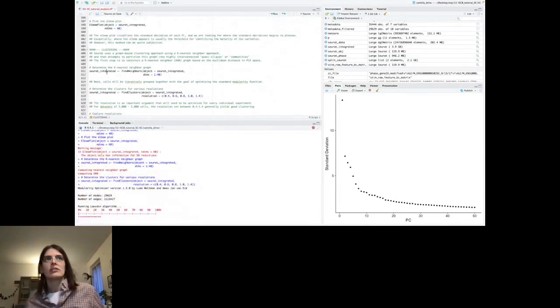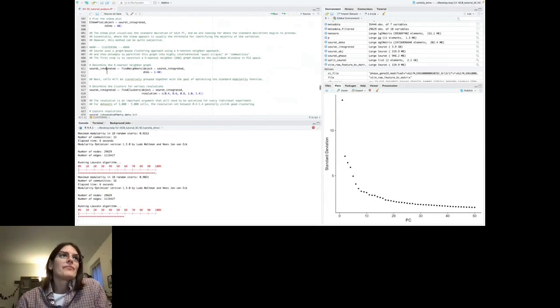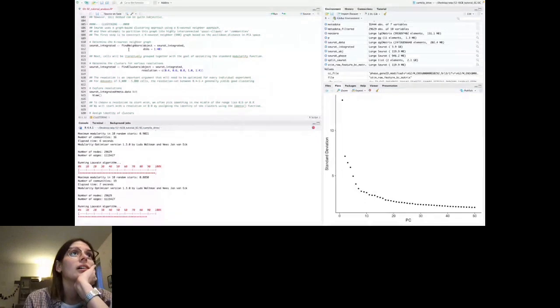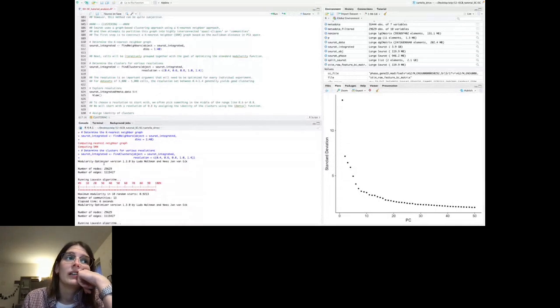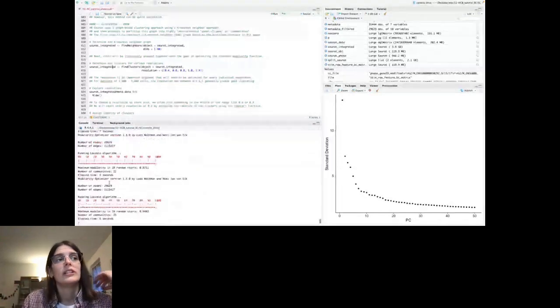It can find neighbors based on the graph that comes out when you plot everything using the information coming from the 40 principal components. Then once we find the neighbors, we perform FindClusters, so we perform the clustering, which is this, as you can see. In the Seurat manual, all these clustering methods are explained very well, because they inserted them in the package.